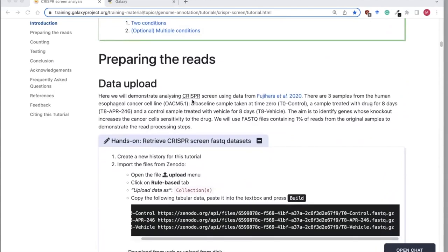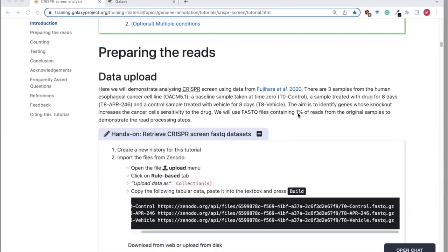The data we're going to use in this tutorial is from a CRISPR screen from this paper here. We've got three samples: a baseline sample taken at time zero, a sample that's been treated with the APR drug for eight days, and a vehicle control sample treated for eight days. The aim is to identify genes whose knockout increases cancer cell sensitivity to the drug.